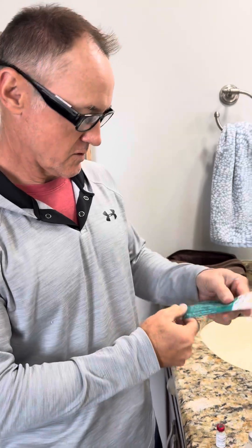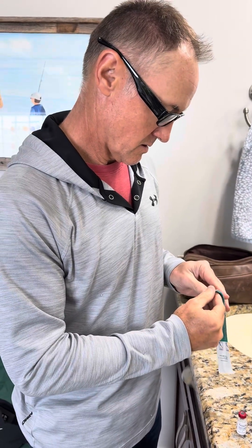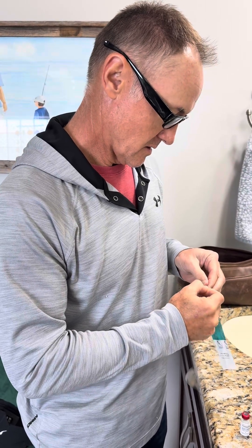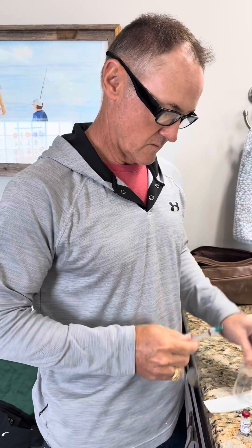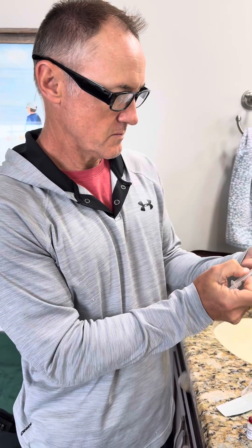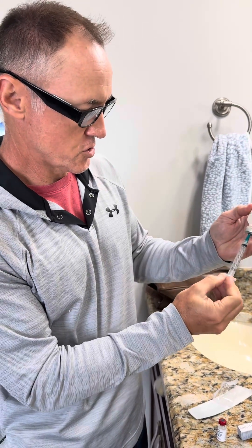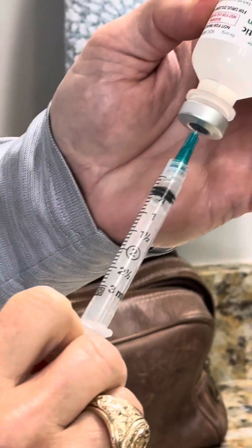So I take my 3cc syringe and I take the syringe out. Needle off, and I get my water. Needle in and I withdraw 2ml, so 2cc's of fluid.